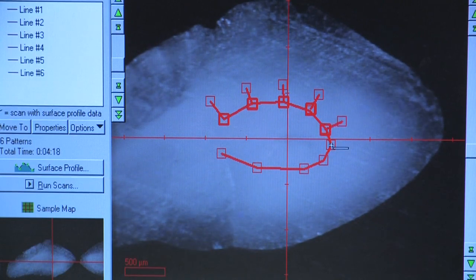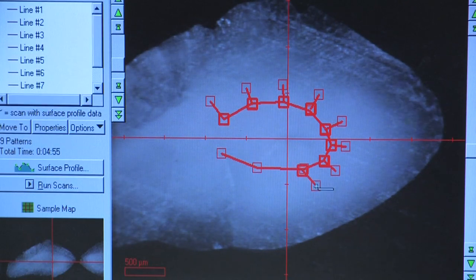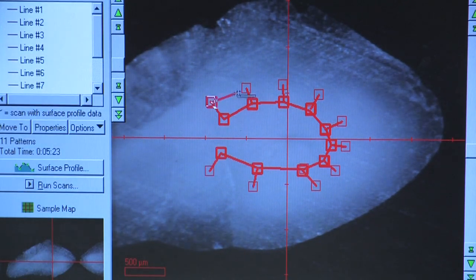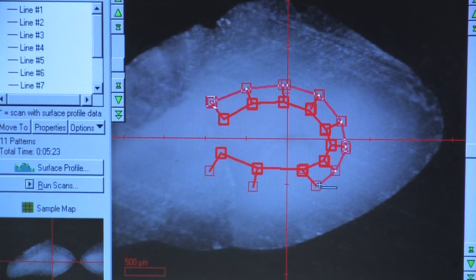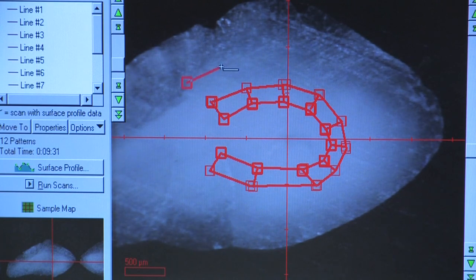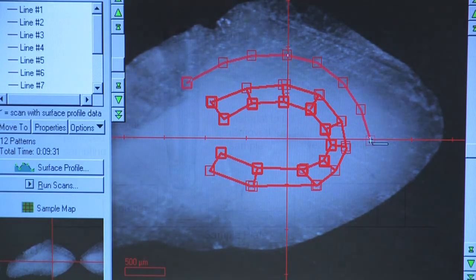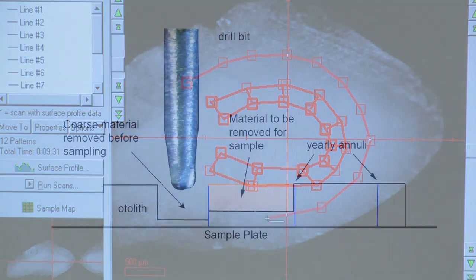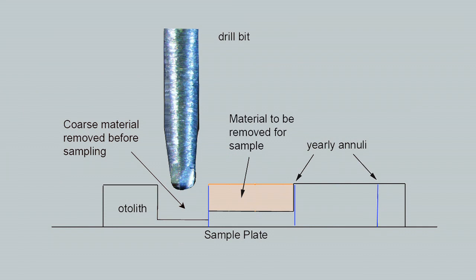You should first set up the micromill as you would if you were taking an ordinary core sample, marking the edge or annulus of the otolith with a line, and then adding another line accounting for the radius of the drill bit. This unwanted material or resin will be removed. It is also good to remove some of the coarse material surrounding your sample. You should only have to remove an area of about one or two drill bits width drilling down almost to the bottom of the sample but stopping before the drill actually drills into the glass slide or the stage plate.